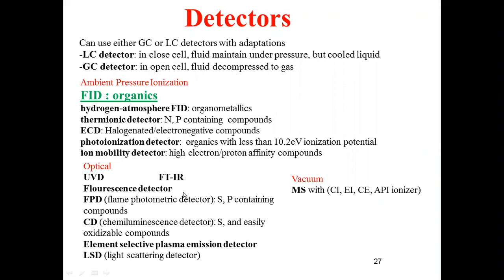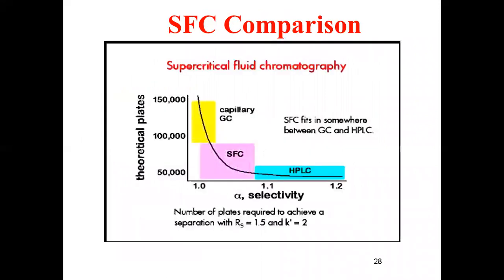While using fluorescence detectors, the emission intensity of a compound, if it is fluorescent in nature, is going to be measured. Otherwise, the transmission is also going to be measured after the molecule is made to excite into a high energy level. So like this, the principle of each and every detector you must understand.